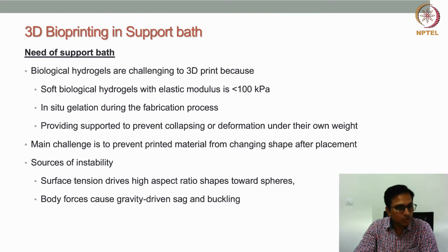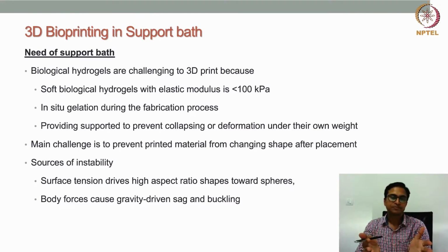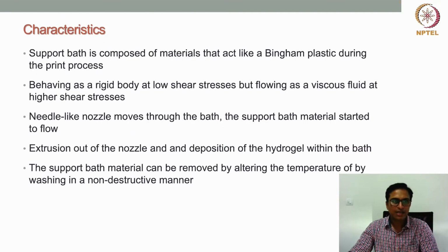So that's what we need: a support bath to provide support to the printed structures, specifically printed structures with low viscosity or low modulus soft hydrogels. These are a few characteristics of this support bath, or 3D printing in a support bath, that whole concept.